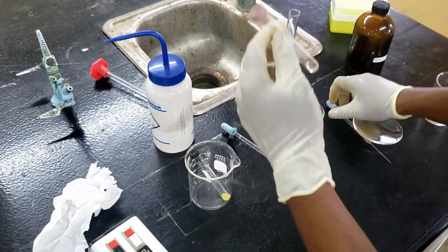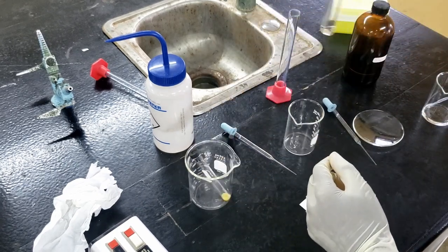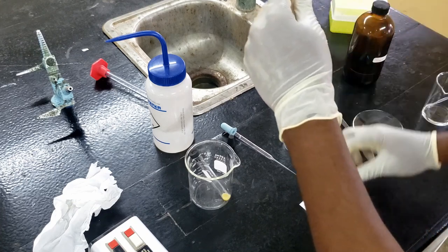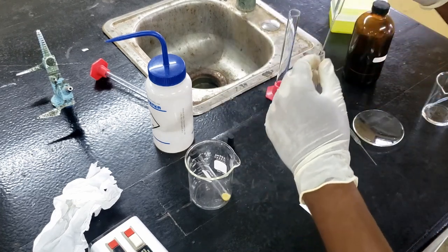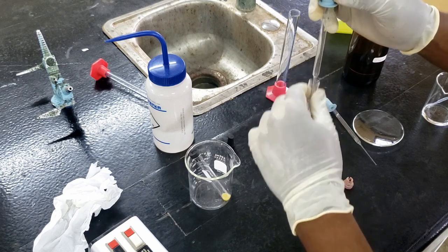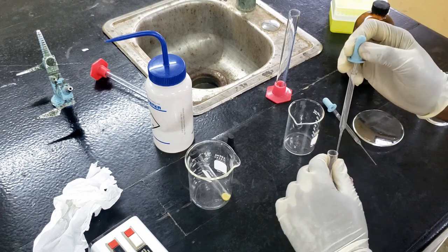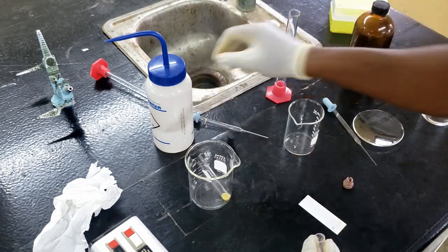Now the p-bromonitrobenzene, we already dissolved some of that solid that we got before inside some ethyl acetate. So I'll just take this pipette, just want some of the solution to stick. I'm gonna put a spot, that's for the P.